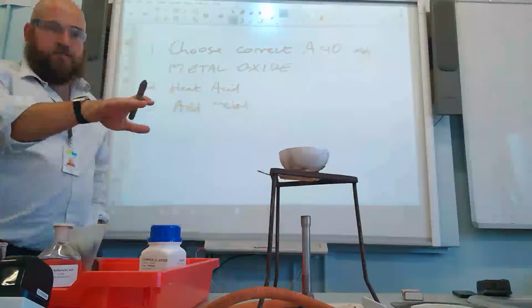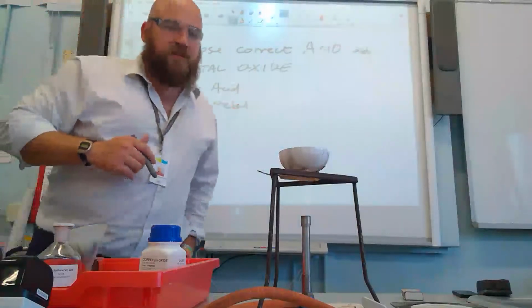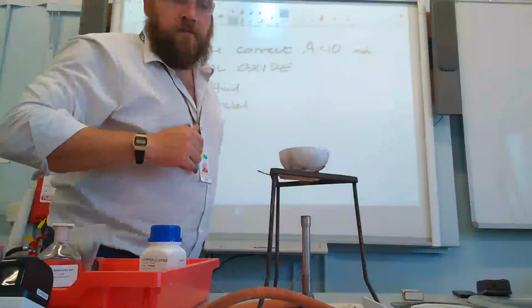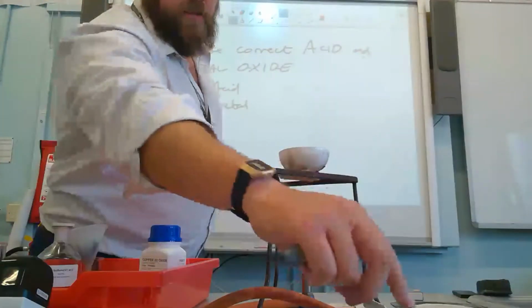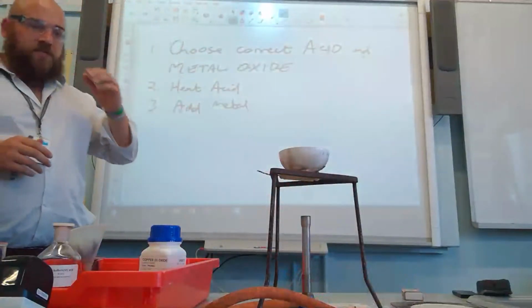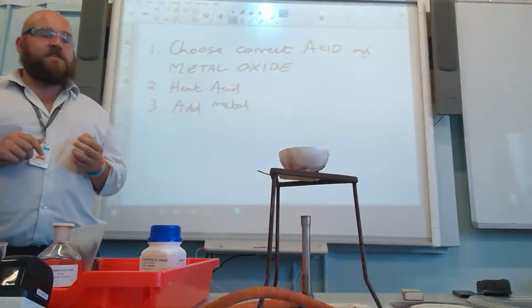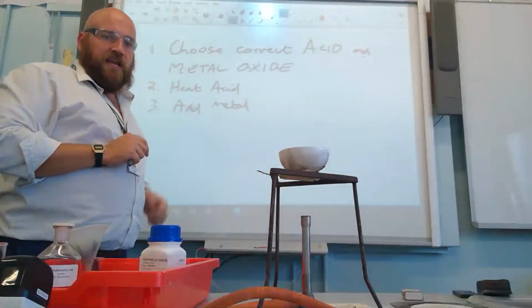Oh, by the way, I'm not just abandoning my chemistry experiment here. I've got a lab assistant who's helping me. Do you think that's about right? There's a few crystals there, yeah. A few crystals, you can see them? Mm-hmm. So apparently we've got a few crystals. So I've just seen my first few crystals. I'm going to leave that to cool now, and I'll put it by the window for 24 hours, and then I'll come back tomorrow, and there'll be some really big ones.